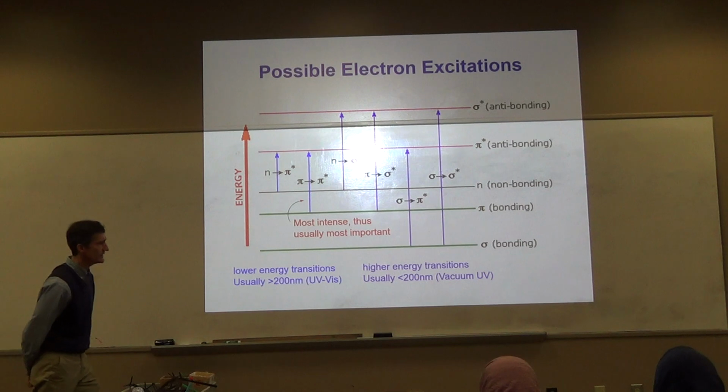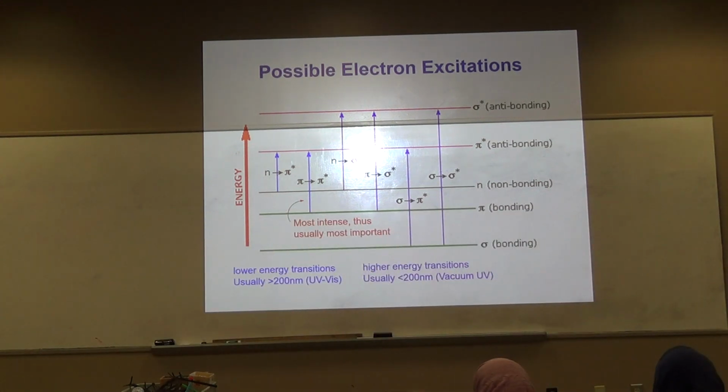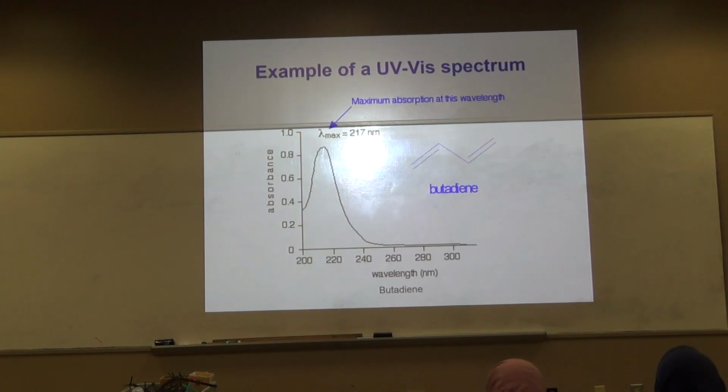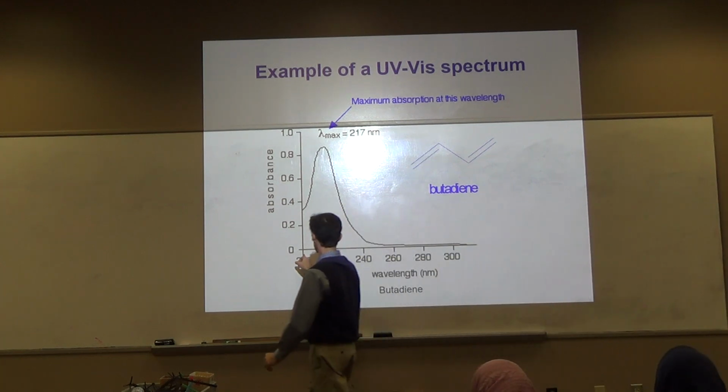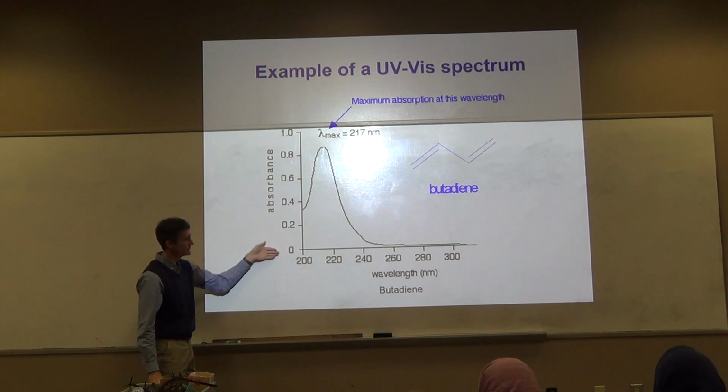And we typically do not scan below 200. Back over here, see how we started? Oh, that's going the wrong way. See how we started at 200? Typically on these scans, we usually don't scan below 200.